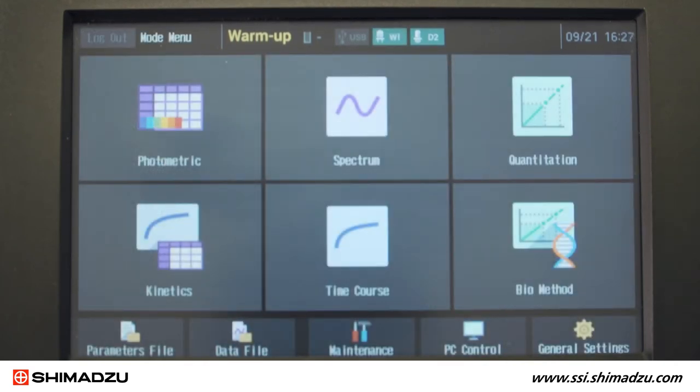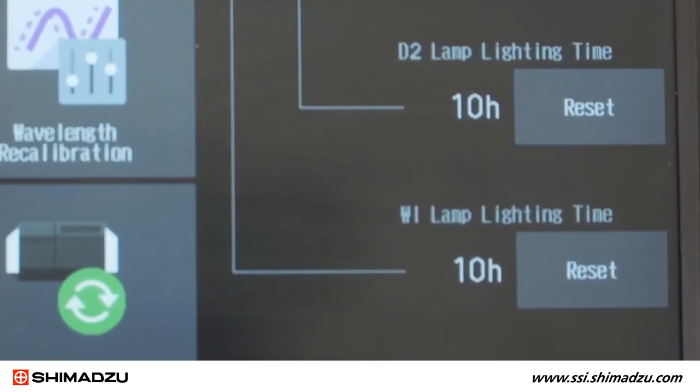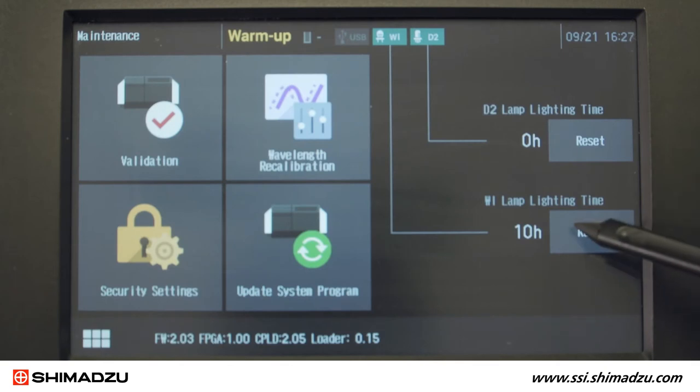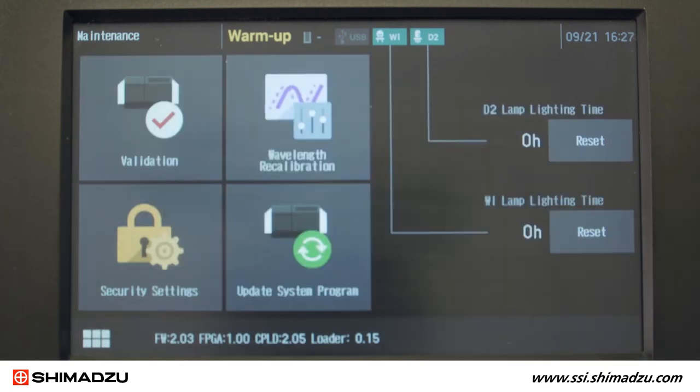Once initialization is complete, you need to reset the lamp hours. From the main menu, press Maintenance in the lower toolbar. On the right side of the screen, you will see the lamp lighting time listed separately for the deuterium and tungsten lamps. Press Reset to set the new lamp hours to 0 hours. The instrument will confirm that you want to reset the hours. Press Yes to confirm.